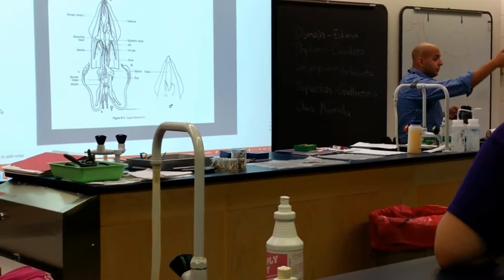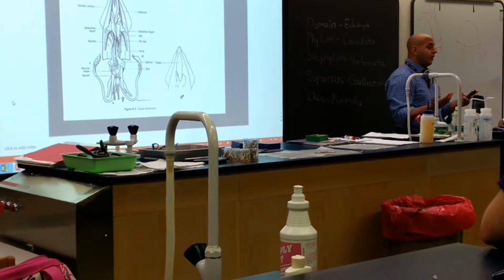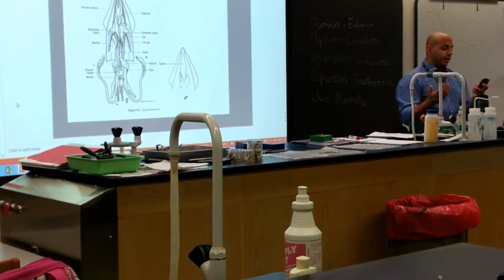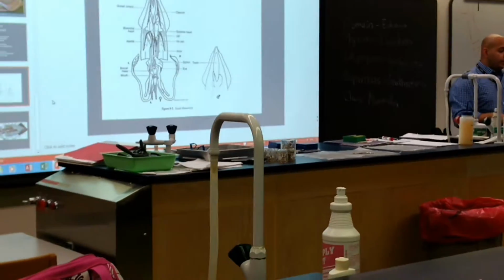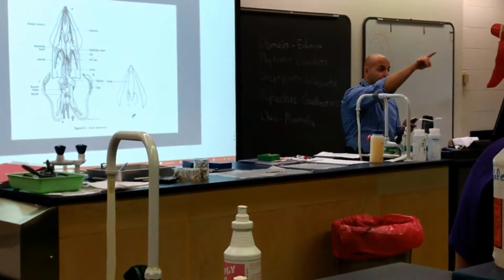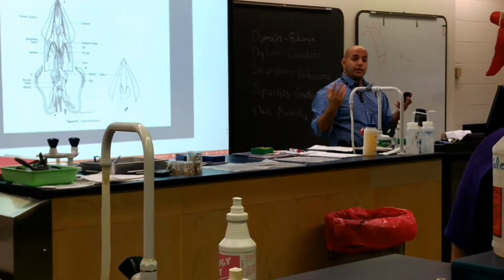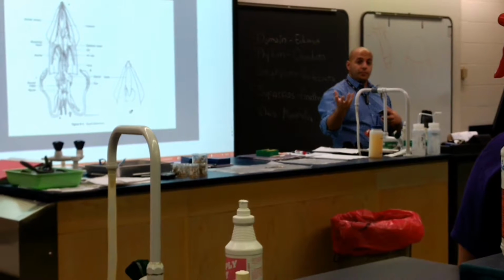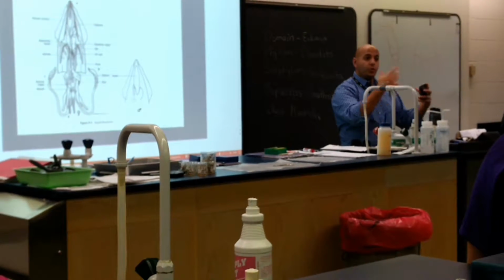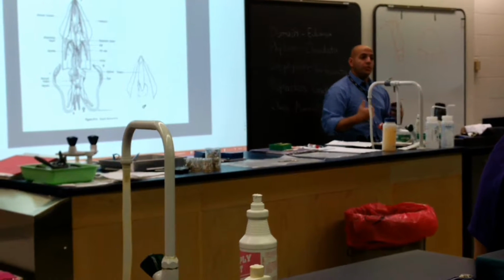You do have a nematode specimen sitting in the back as well. I want you to be familiar with him. I want you to be able to tell male or female and all that. I have in the back an insect metamorphosis slide, and I want you to remember that insects do undergo metamorphosis, either complete or incomplete, so it would be easy for you guys to distinguish which one you're looking at.